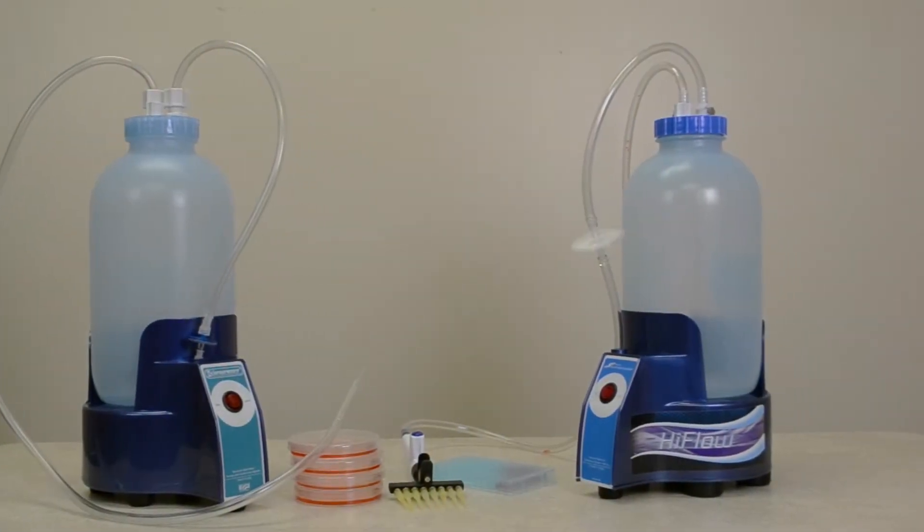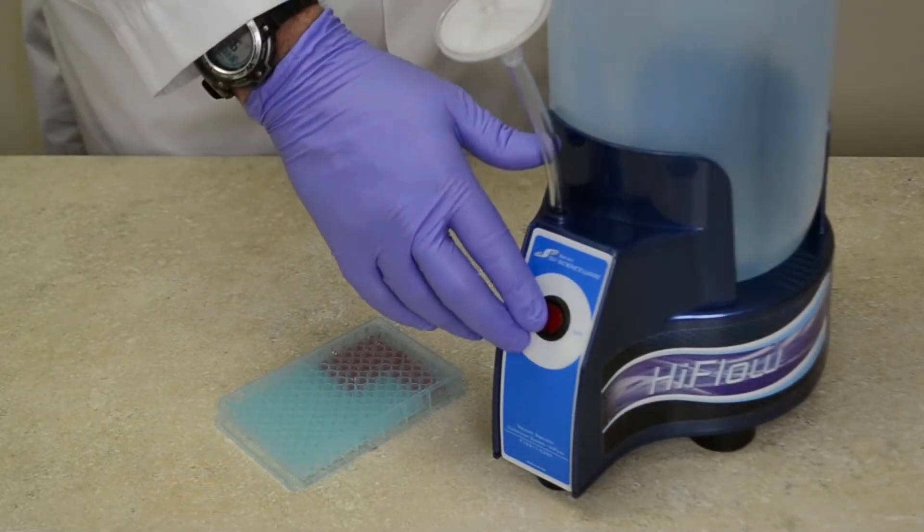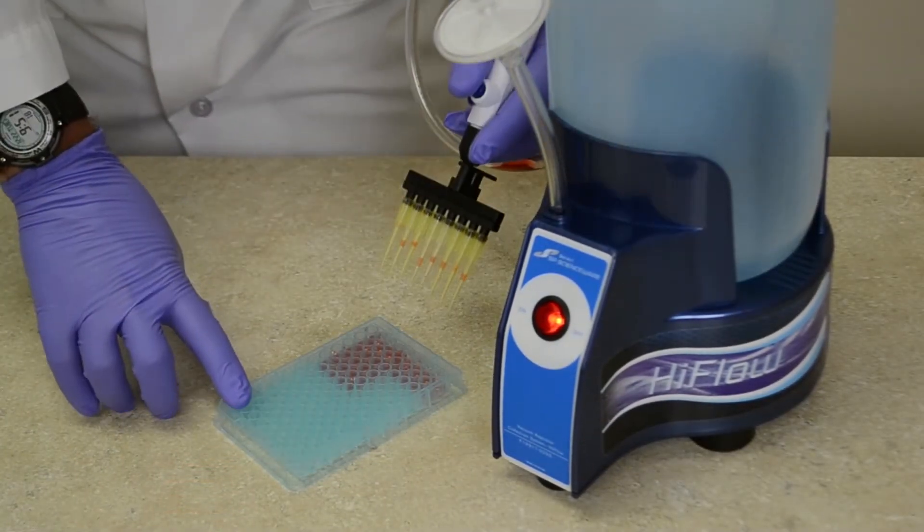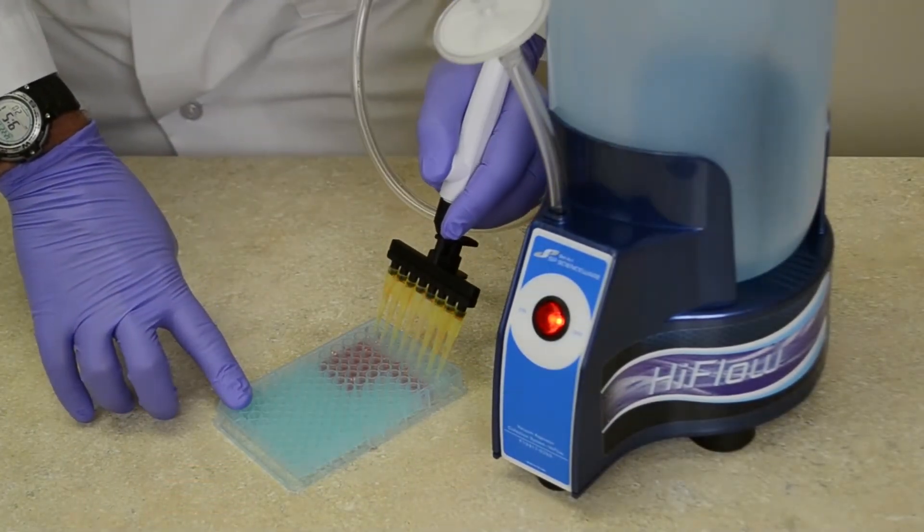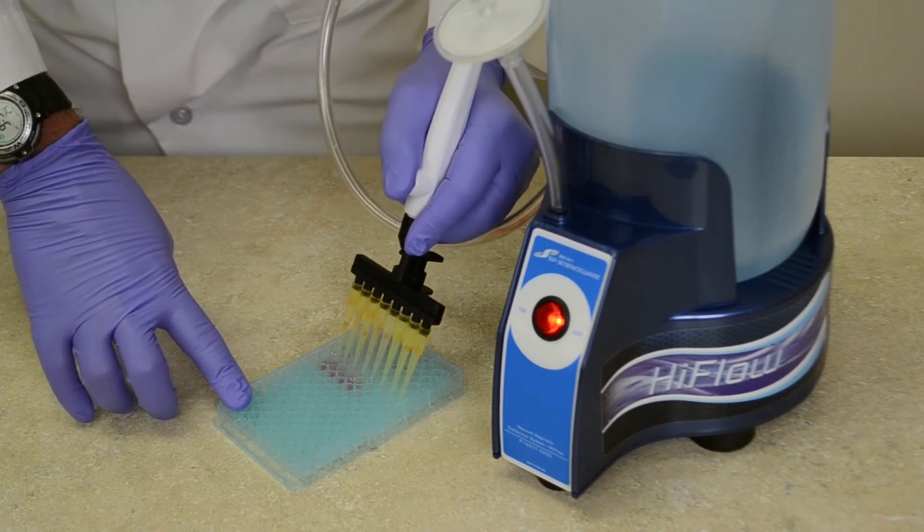The systems are available in original and high-flow models. The high-flow model has a stronger flow rate that works reliably with up to 8-channel pipette tips, even with 4-channels empty.